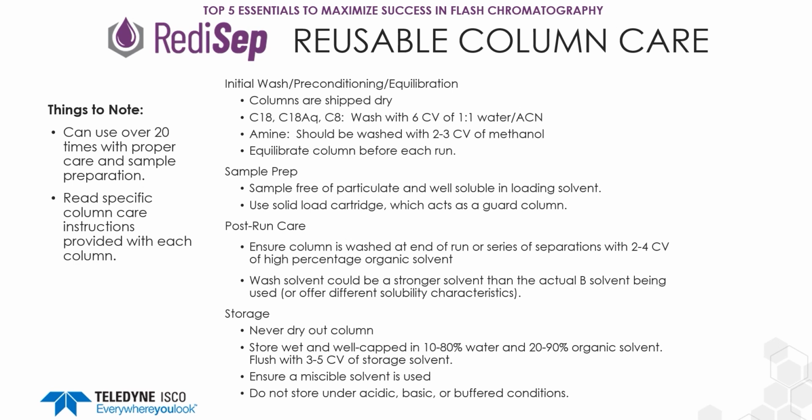And always make sure that you're using miscible solvents. This isn't going back to elementary school where you want to see water and oil separate. Let's always make sure that we're using miscible solvents. So miscible means that those solvents can interact with one another, that they're not going to separate. It's hard to separate different components of a mixture if your 2 solvents don't want to mix. So always use miscible solvents when storing those. Make sure that they're well capped. You're typically going to look at like 10 to 80% water and 20 to 90% organic solvent. Anything that falls within those guidelines is good.